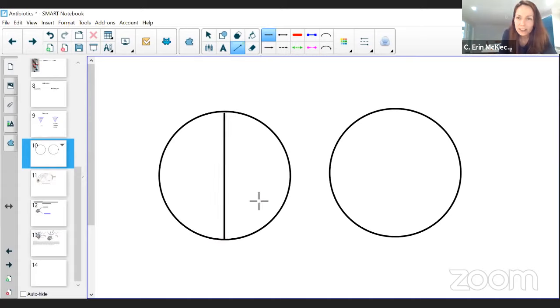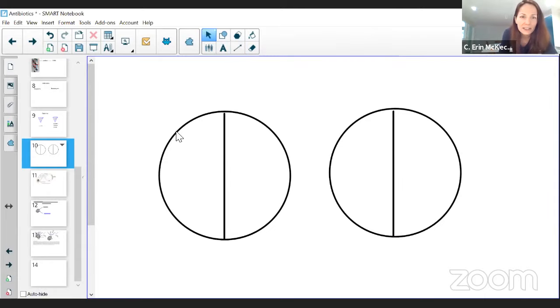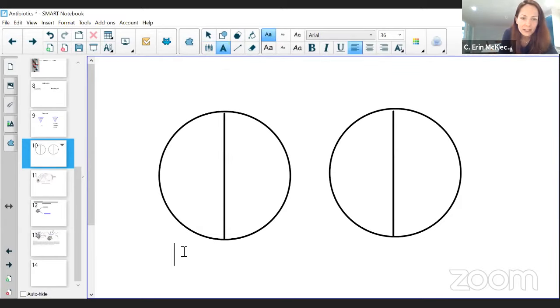If you end up doing this experiment, I just wanna emphasize that the labeling doesn't have to be perfect. I know a lot of students get upset if it doesn't look just right, but it doesn't have to be perfect. We just need a space, an area for each antibiotic. Now remember that, well, you know what? Let me write down here like this.